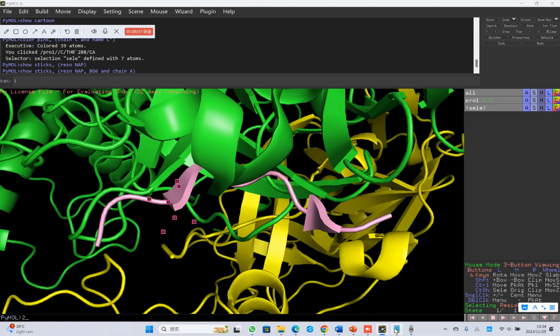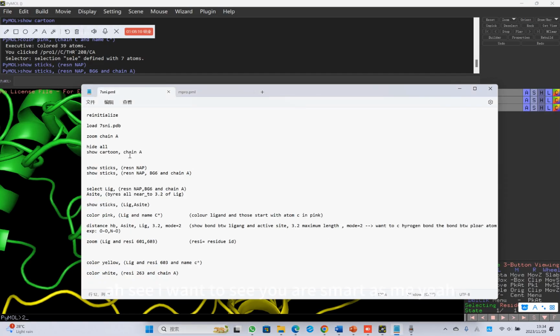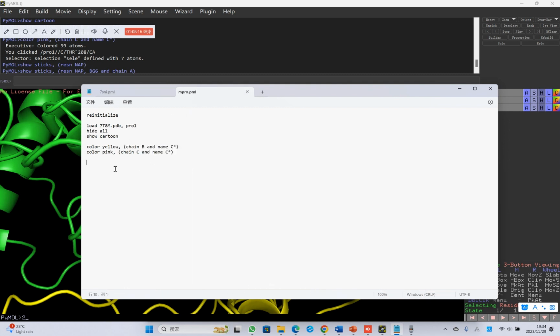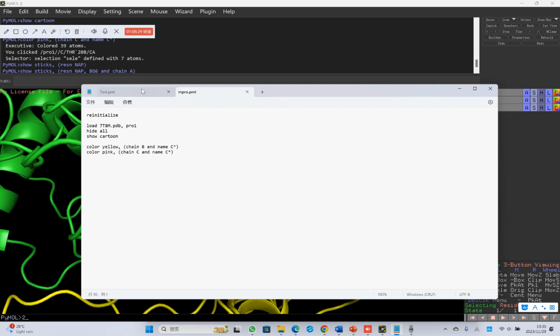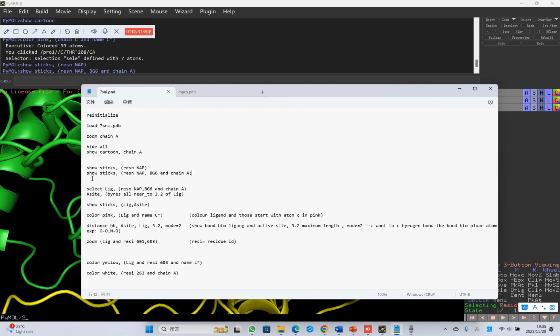Please show. You see? I want to see if you are as smart as me. Chain C. Zoom. Oh, you got the hint. Oh, you are cheating. Alright, okay. Can you show this one?